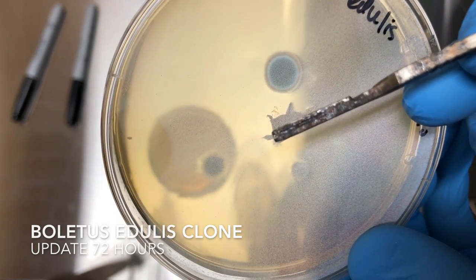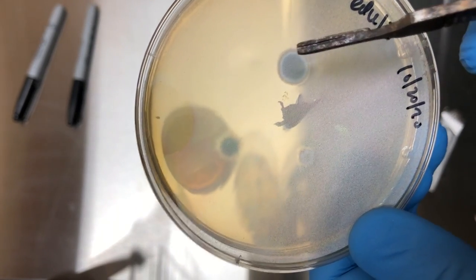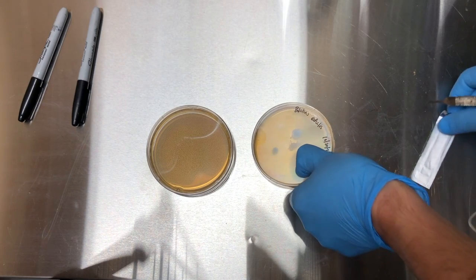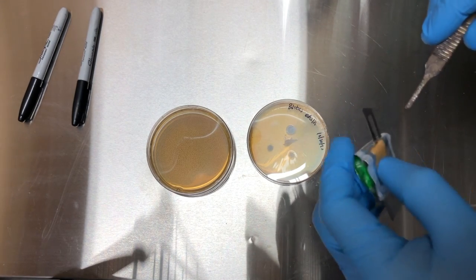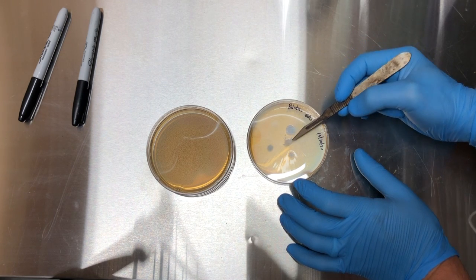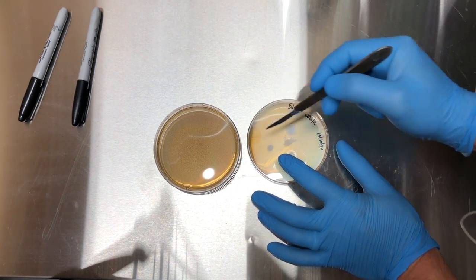Here is that Boletus edulis that I cloned, and you can see there's some fresh mycelium coming out of the tissue, so this is going to be my target mycelium. The only problem is that there's some trichoderma and penicillium forming around our target mycelium, so we're going to have to transfer this onto some fresh plates. It's much easier to save the fresh mycelium than to try to cut out the contamination, because these are already sporulating whereas the mycelium is relatively fresh and still intact.